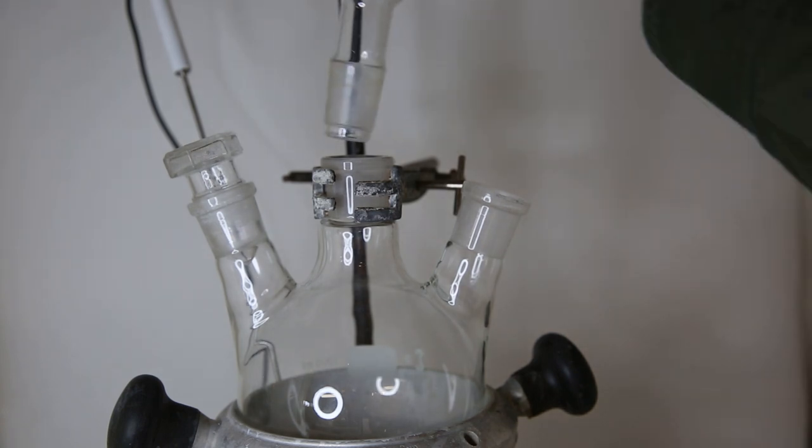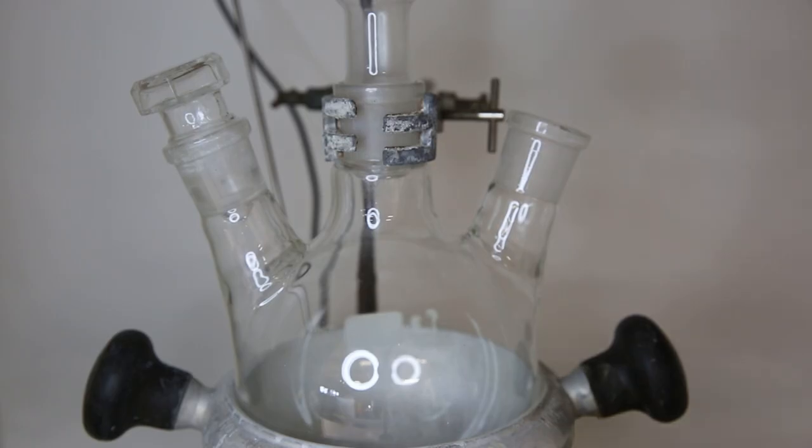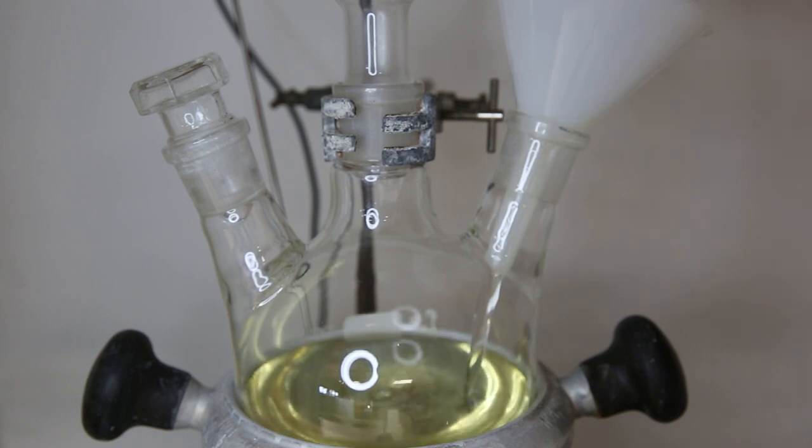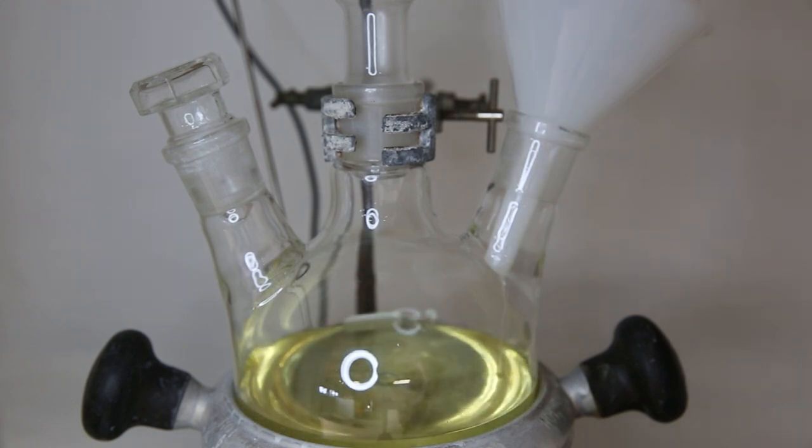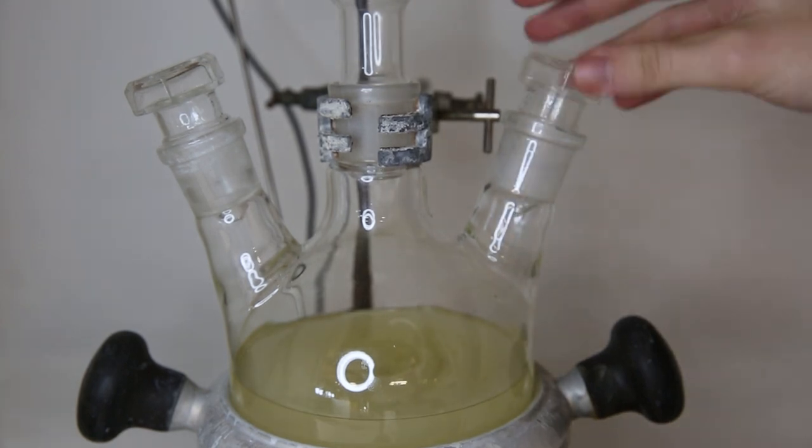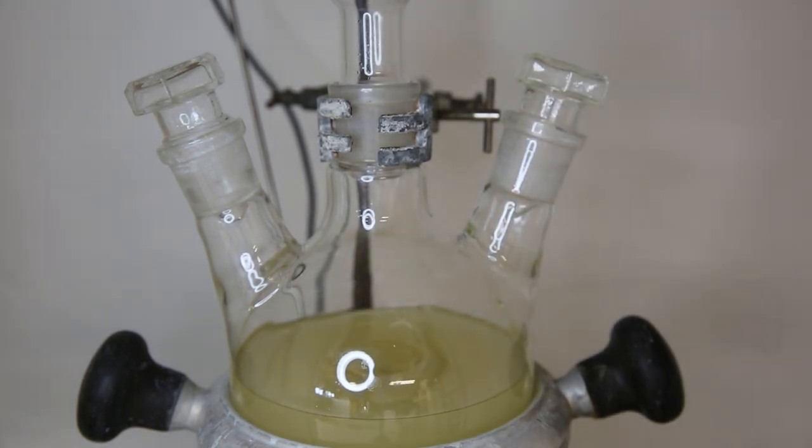Then I set it up for a simple reflux, and I can now add 500 milliliters of the dried sunflower oil to the reaction flask. While stirring, I add the methanol sodium hydroxide solution to the oil, and stopper the flask, and start heating the mixture to 60°C. So now the reaction can just be left alone for a few hours, and I can come back later.